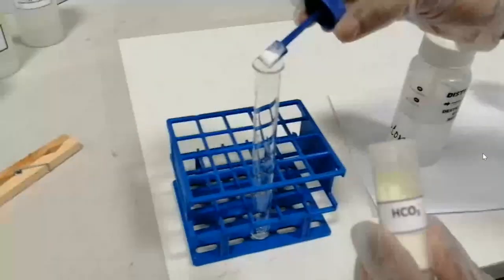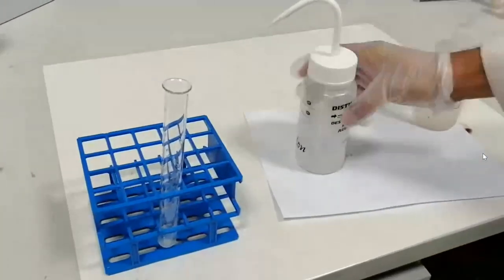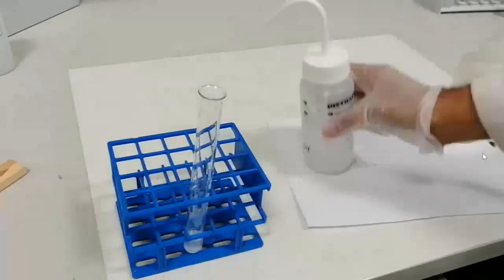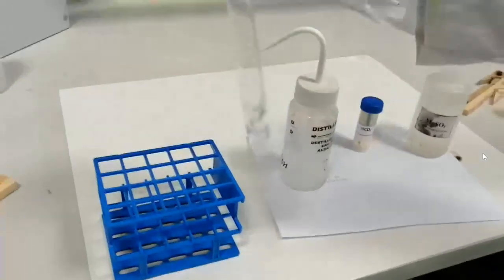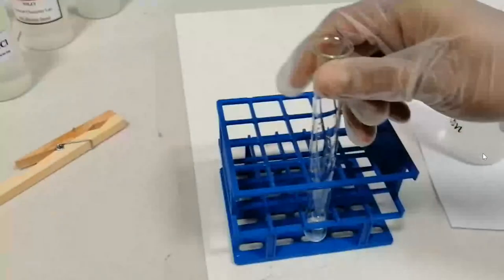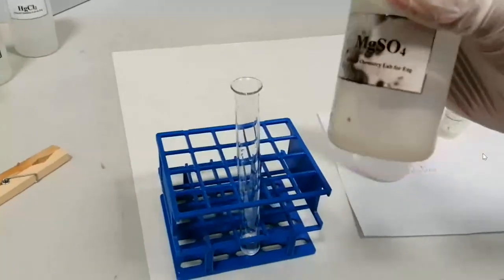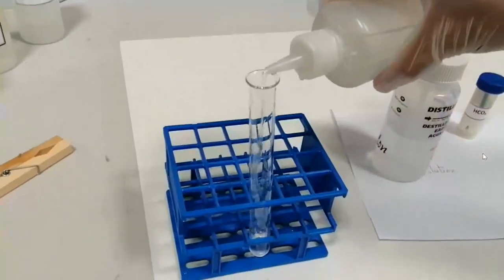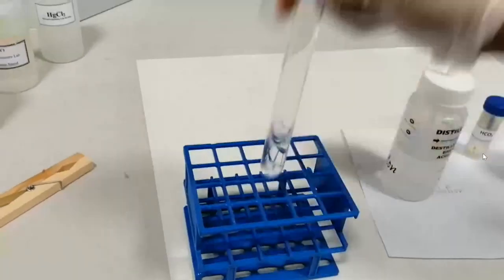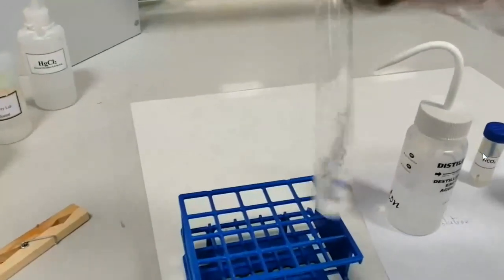First of all, you have to prepare a solution: a few crystals plus a few milliliters of water, and then mix them very well. Okay, great. You have a clear solution. And then add just magnesium sulfate, MgSO4. You will see nothing on cold. So you have to heat in a water bath in order to see this kind of turbidity.